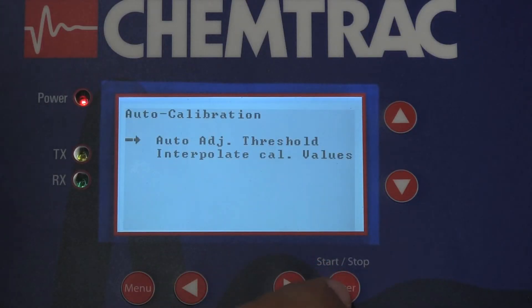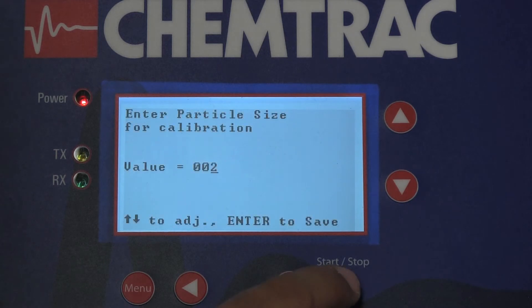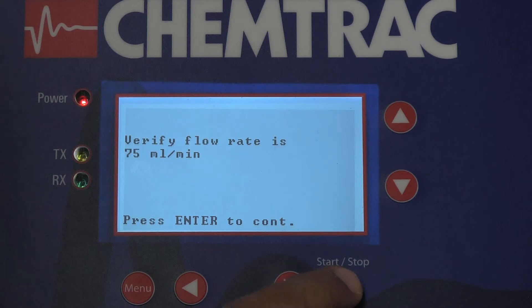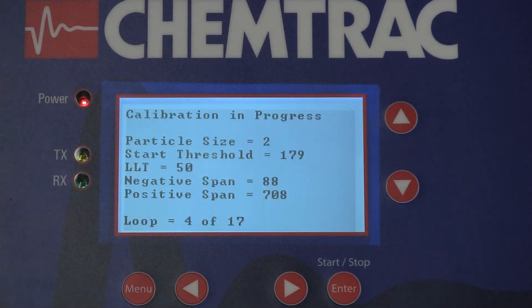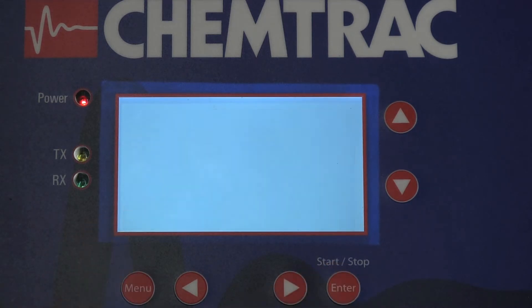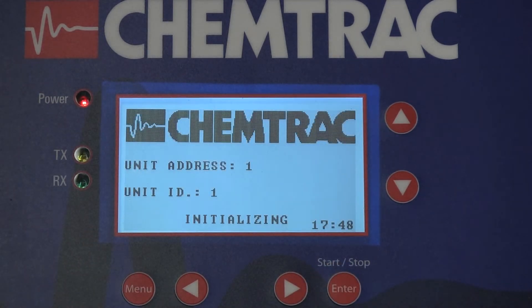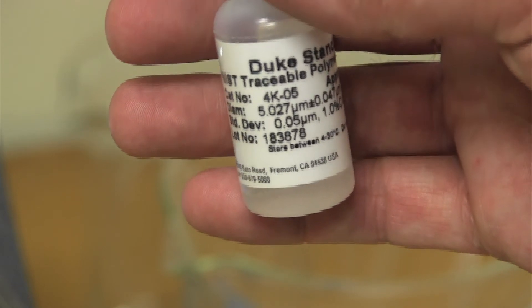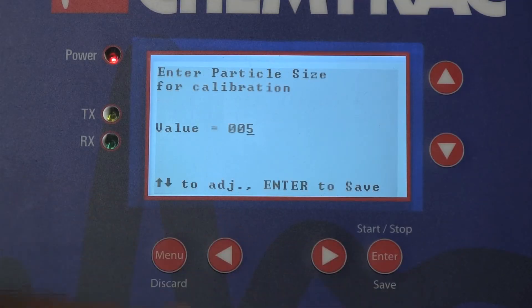Once the 2 micron standard solution is made, the auto calibration process can proceed. The analyzer will automatically determine the appropriate threshold settings. After saving the settings for the 2 micron spheres, solutions for the larger particle standards can be prepared and processed in the same fashion.